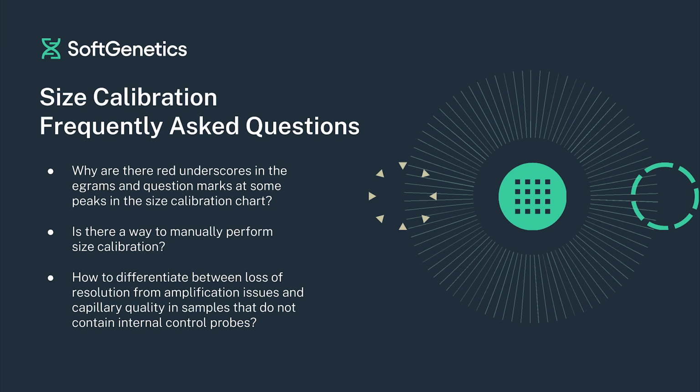The first one will be taking a look at why there are red underscores in the electropherograms and question marks at some of the peaks in the size calibration chart. The second, is there a way to manually perform size calibration if there's a disagreement? And lastly, how to differentiate between loss of resolution from amplification issues and capillary quality in samples that do not contain an internal control probe or internal control probes. If any of these three are areas where you have questions, please keep listening and watching.